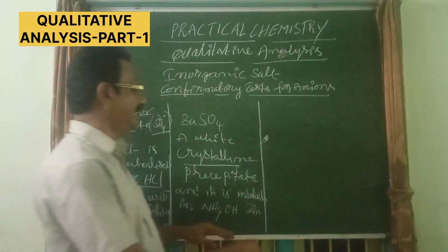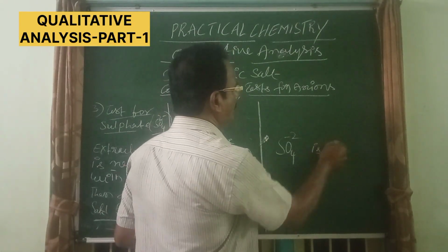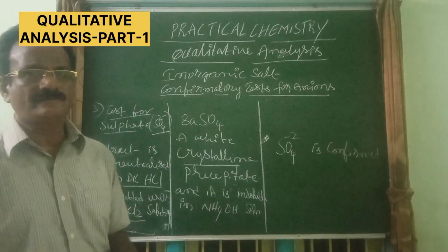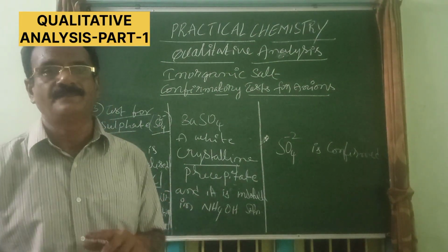Okay, so then we can confirm SO4 2 minus. Okay, so this is about the confirmatory test for sulfate.